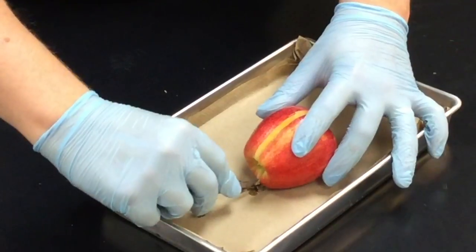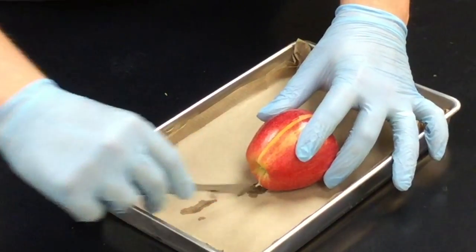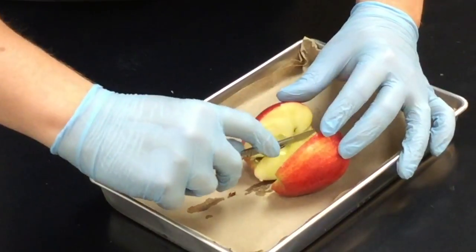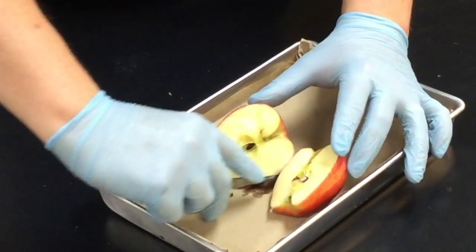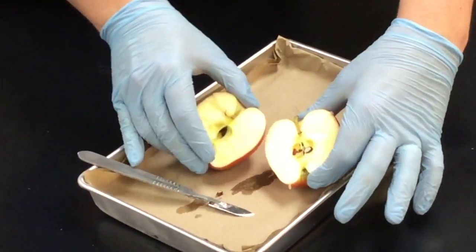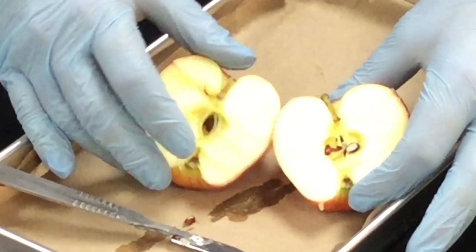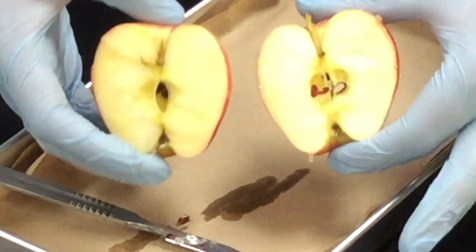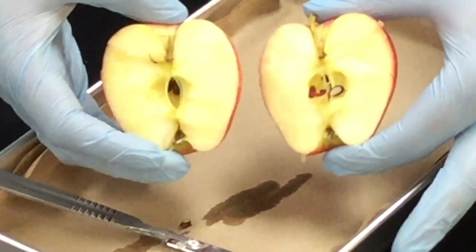So as you get the specimen more and more cut, go ahead and try and loosen it so you can see inside, so you know where to make your next incision. Now if you look at the edges of the apple, you can see how clean and nicely cut they are. There are no jagged edges. This is going to allow you to preserve the inside of the specimen so we can see it in greater detail.